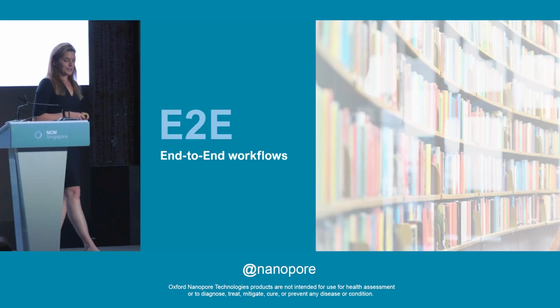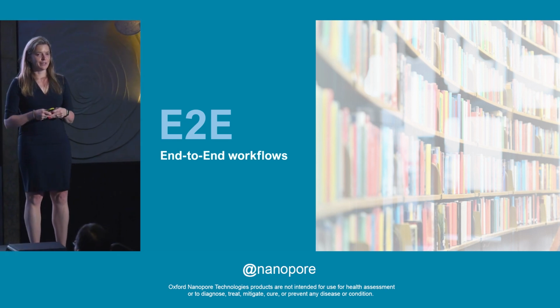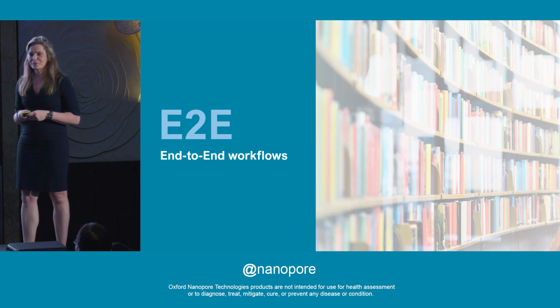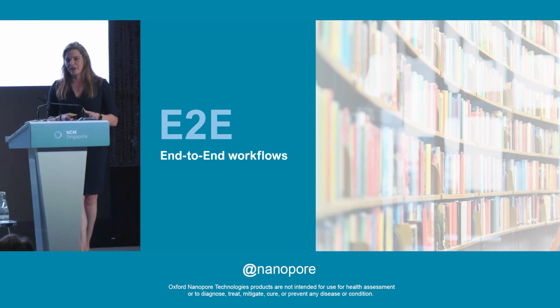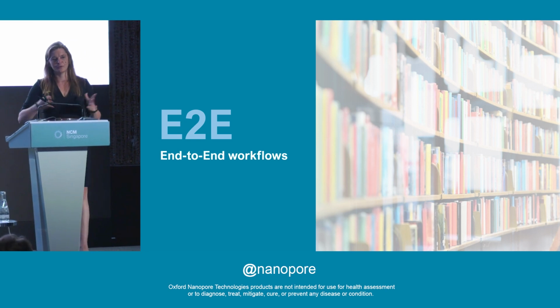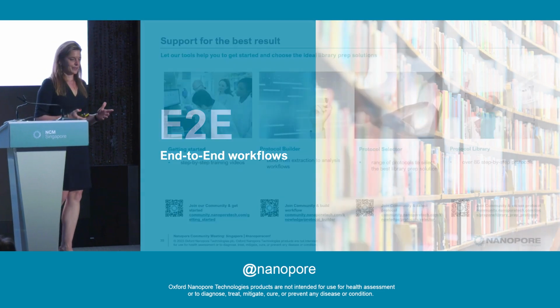We've talked a lot about T2T today. I'm going to talk a little bit about E2E. These are the end-to-end workflows that we are pushing together. We hear a lot of feedback from the user community. If you go online, there are a lot of protocols, there's a lot of advice.